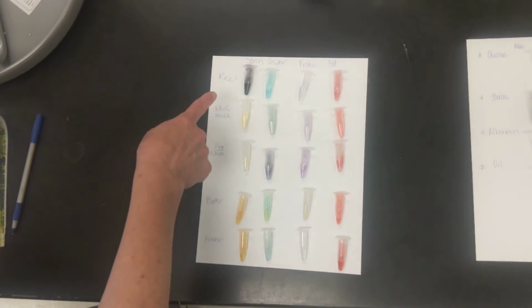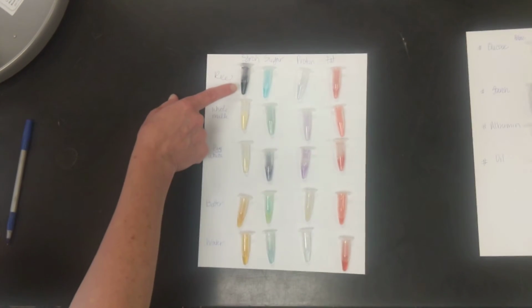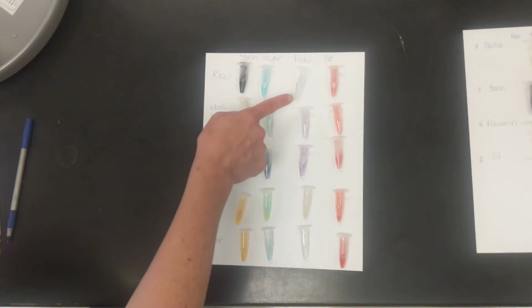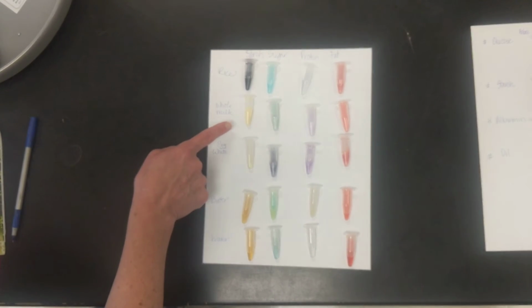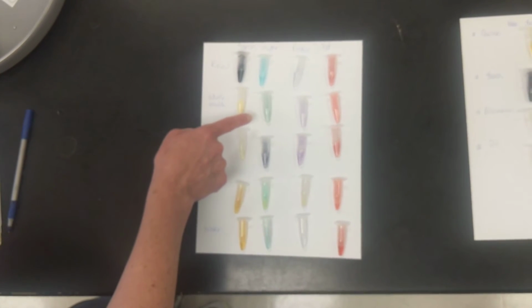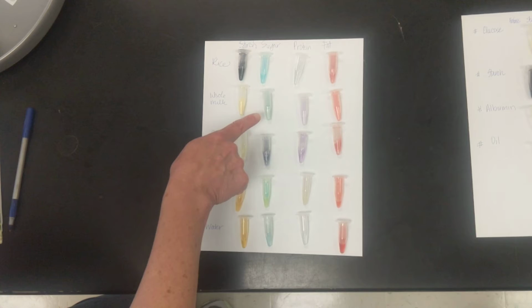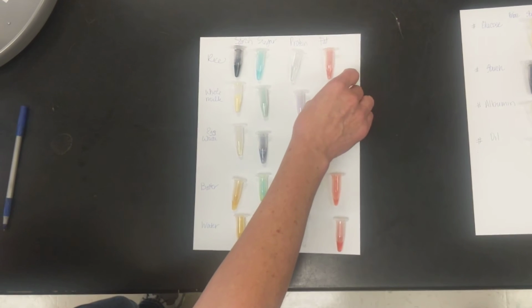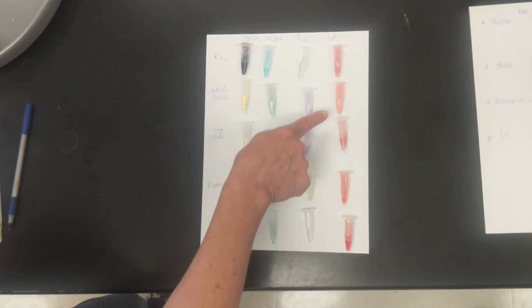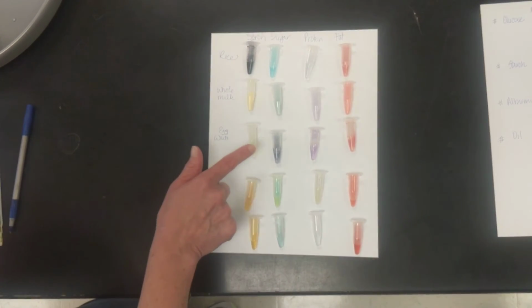Okay, so here are the food items that we tested, and we were looking to see if there was starch, sugar, protein, or fat in any of them. So our rice has starch in it, no sugar, no protein, and no fat. Whole milk doesn't have starch. This actually turned a little green, so it's a little different than our original test. You might say there's trace amounts of sugar in our whole milk. There's definitely protein, and it looks like we might have a little bit of fat because that's a much brighter red than the others. Our egg white, no starch.